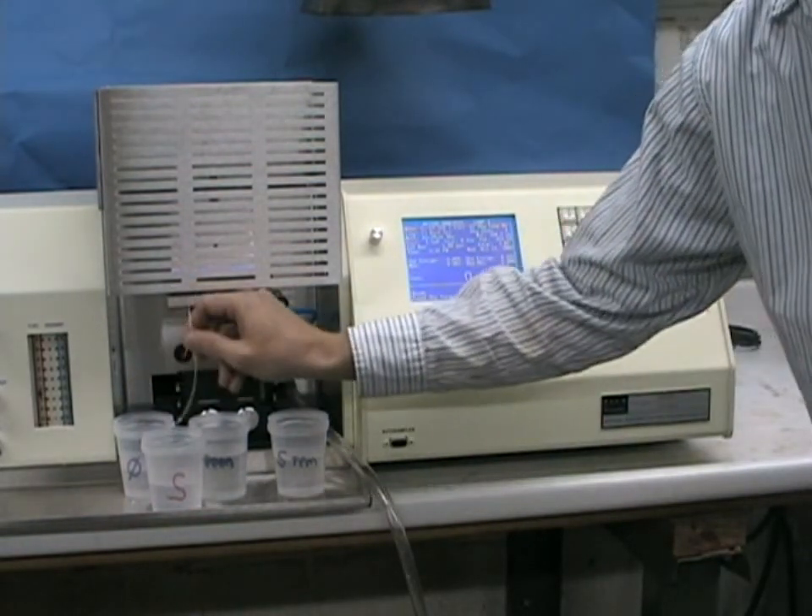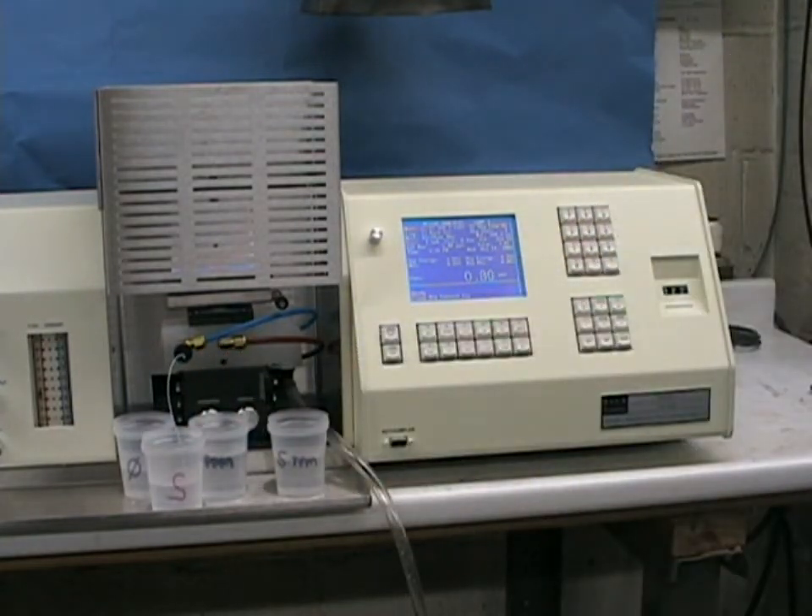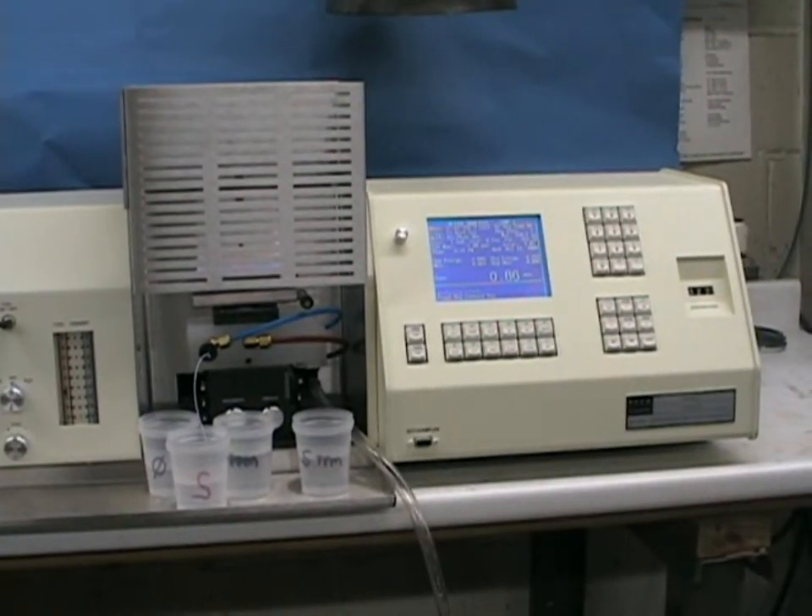Wait a few seconds for it to stabilize, and press the READ key. If using an external software program, a printer, or a PC-based data collection routine, we can take multiple readings of the sample, and the statistics based on the sample identification will be automatically calculated by the system. The ability to get such data without the need of an external PC is a valuable option for those companies doing pharmaceutical, food, or consumer product material, where CFR requirements may become an issue. As you can see by the reproducibility of these readings, our stability is excellent.